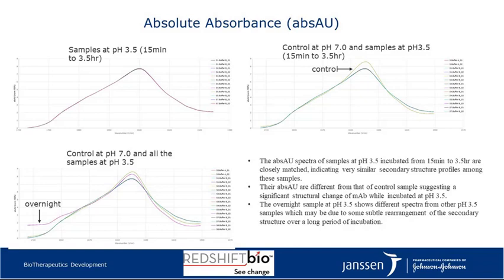And there's many items that might be represented by that change. It could be a drift in sample change, like background subtraction change, but we believe from including the data and discussion further that this may actually be a true change in conformation in the protein secondary structure.